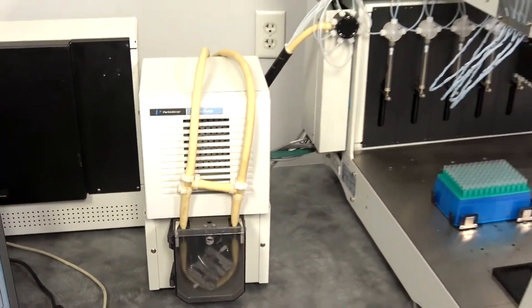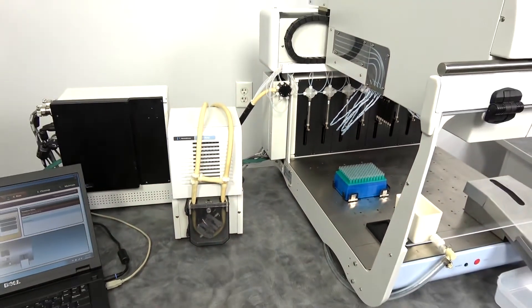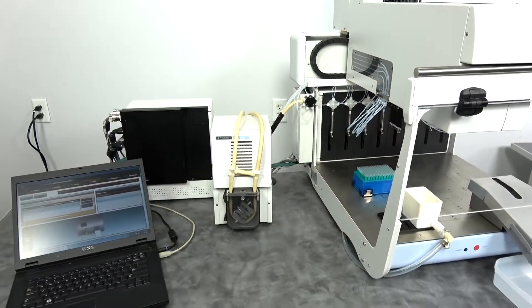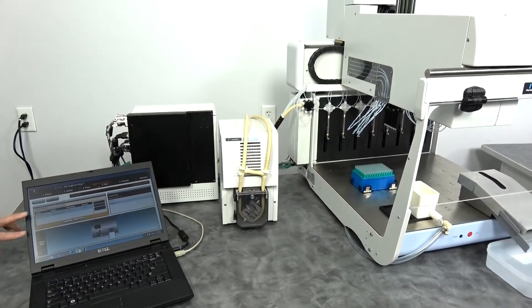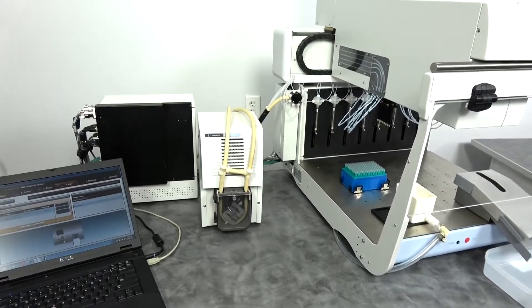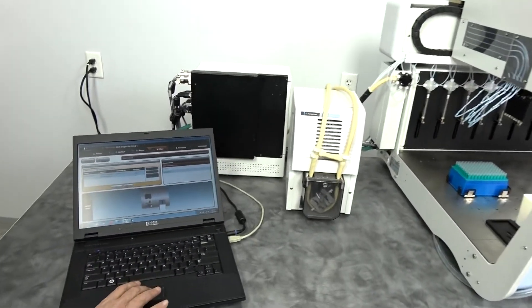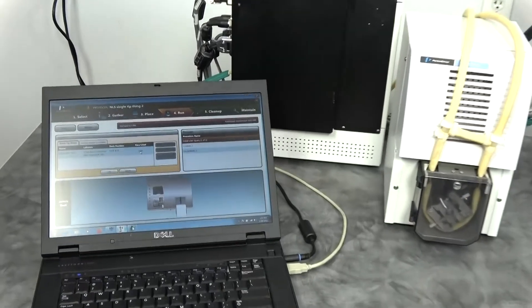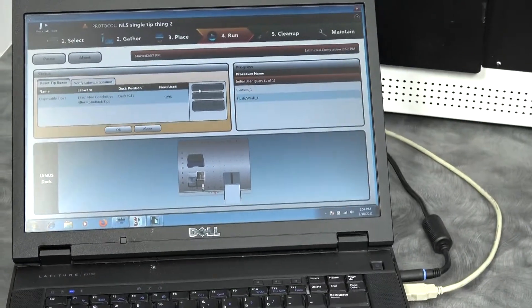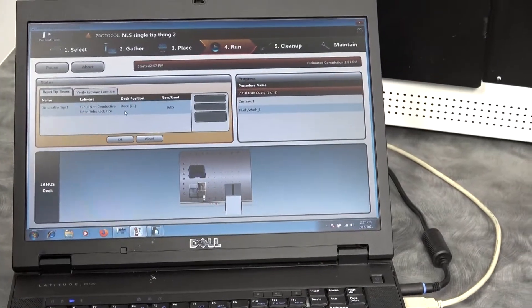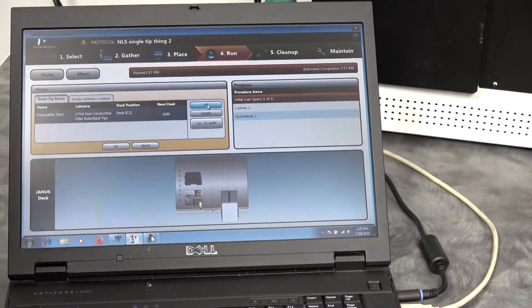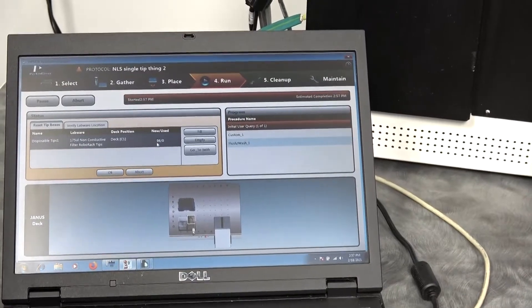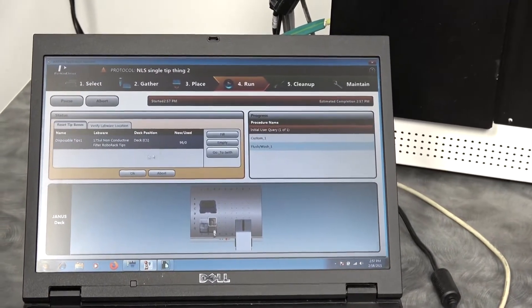It comes up into a submenu telling you that it needs tips or that you need to verify the tips. In this case, it shows there were no tips remaining in the last run. We're going to tell it to fill. Now it has 96 tips available.